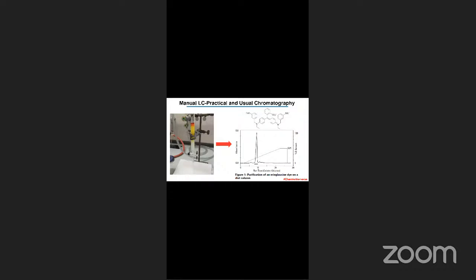In this case, the peak that is mentioned is showing some value of absorbance, which means they have used UV as a detector. And these are the terms that I'm going to use and explain to you. They're called modules in the chromatography system. Mostly people don't like chromatography because they get scared when they see this kind of terminology. For me, I have learned chromatography like a user, where I know how to separate the molecule rather than knowing all the features of the instrument. Because I think knowing too much sometimes prohibits you from doing the work.